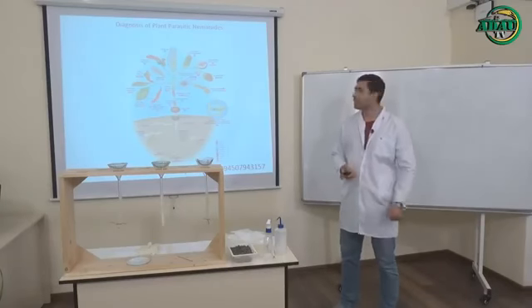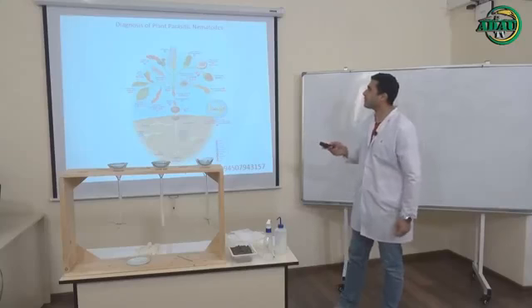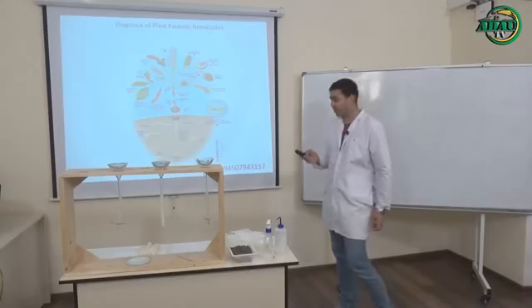Today I will talk about diagnosis of plant parasitic nematodes in laboratory condition.